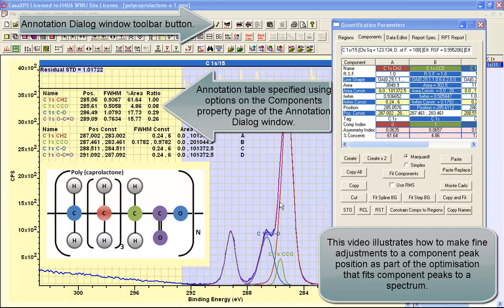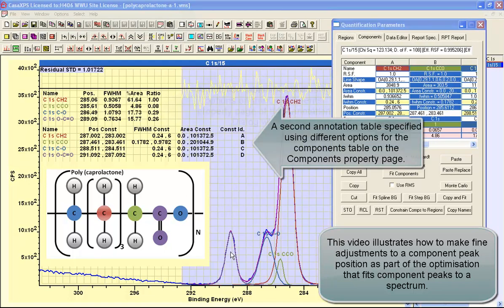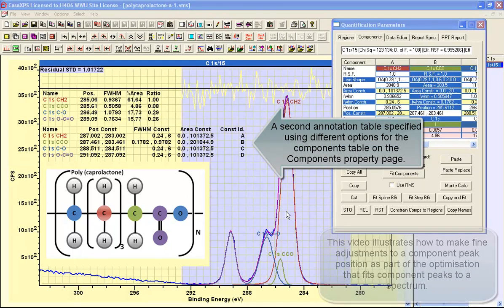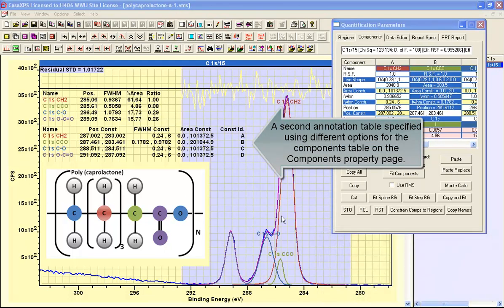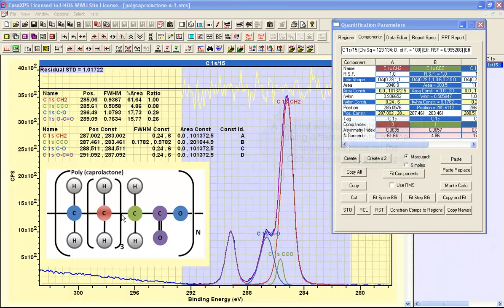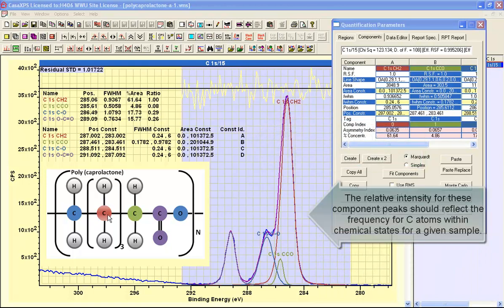This carbon-on-S spectrum has been measured from polycaprolactone. The idea of constructing a peak model is that the intensity of these peaks should reflect the number of atoms that are found in these different chemical states for carbon.